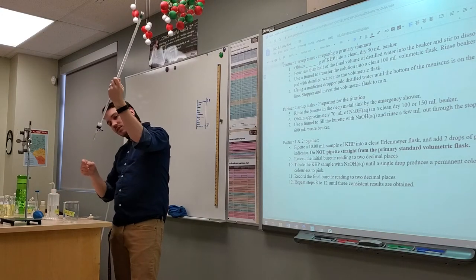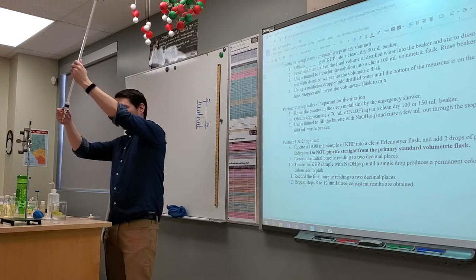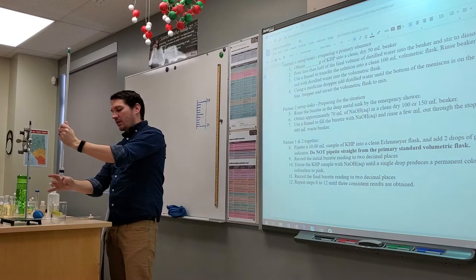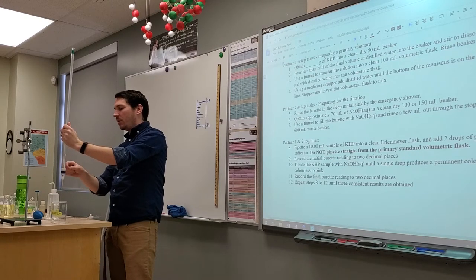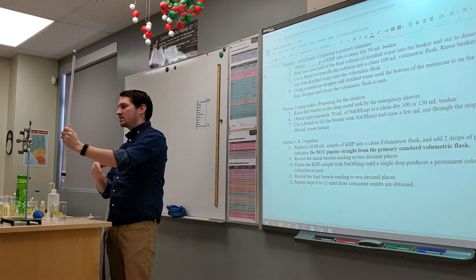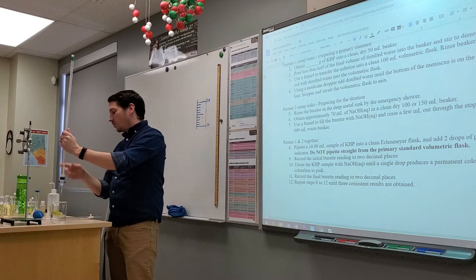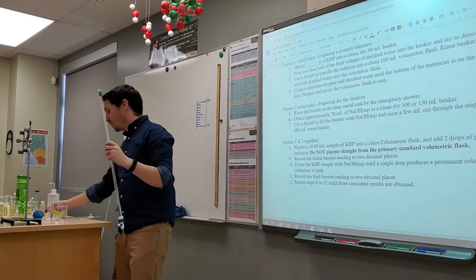Now, I don't know if you can tell, you probably can't, but when I did that, I noticed a small air bubble in here. You want to get any air bubbles out, because if the air bubble comes out in the middle of titration, that's going to mess with your volume. So just drain it. Just wait for it to drain. It's totally fine. And once it's drained, then you can properly fill up your burette.